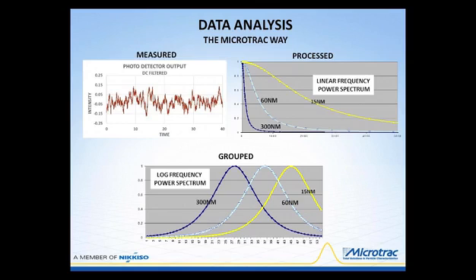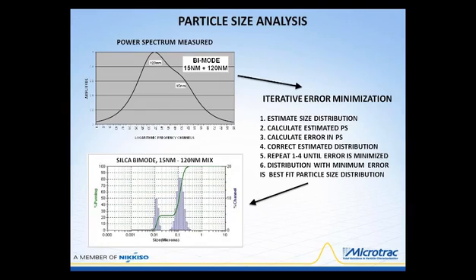Each one of those channels has a center frequency that is in the logarithmic progression. That has very important ramifications when you go to analyzing an actual measured power spectrum.